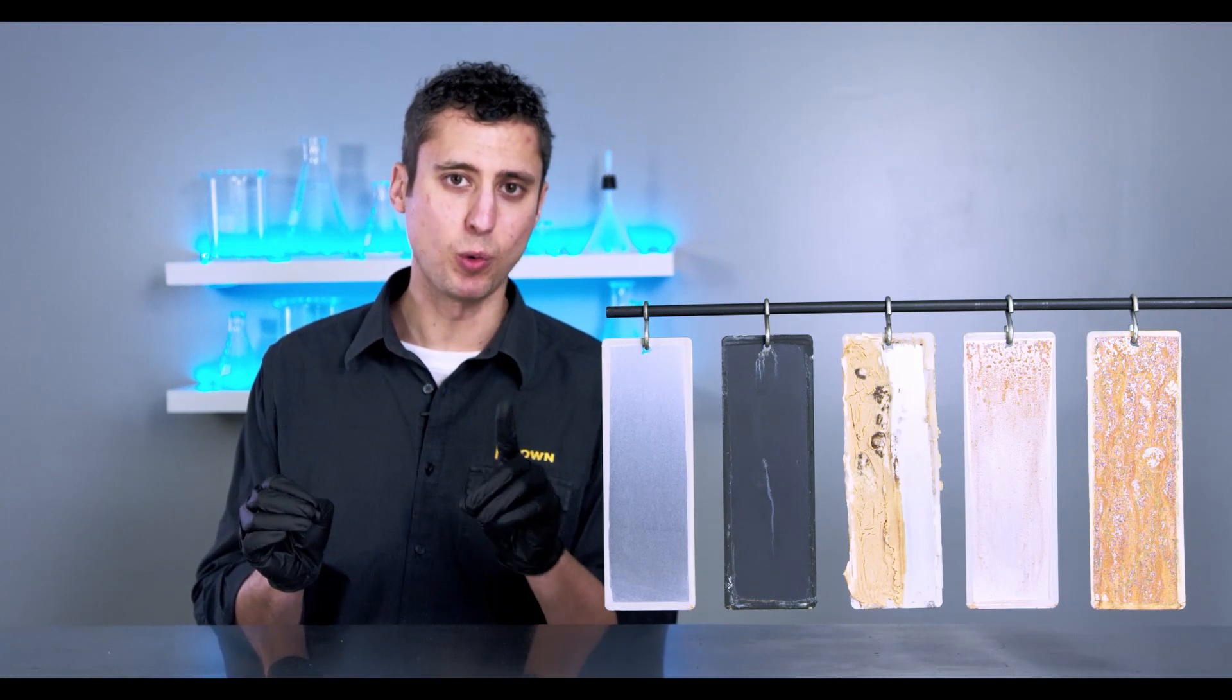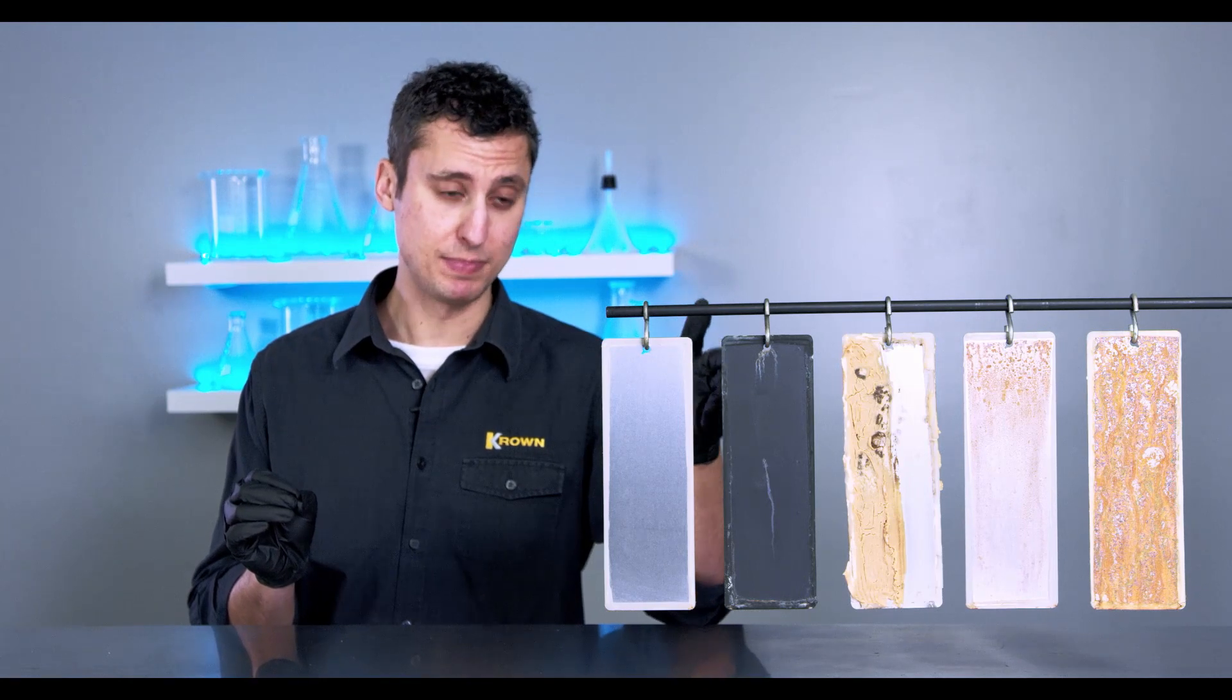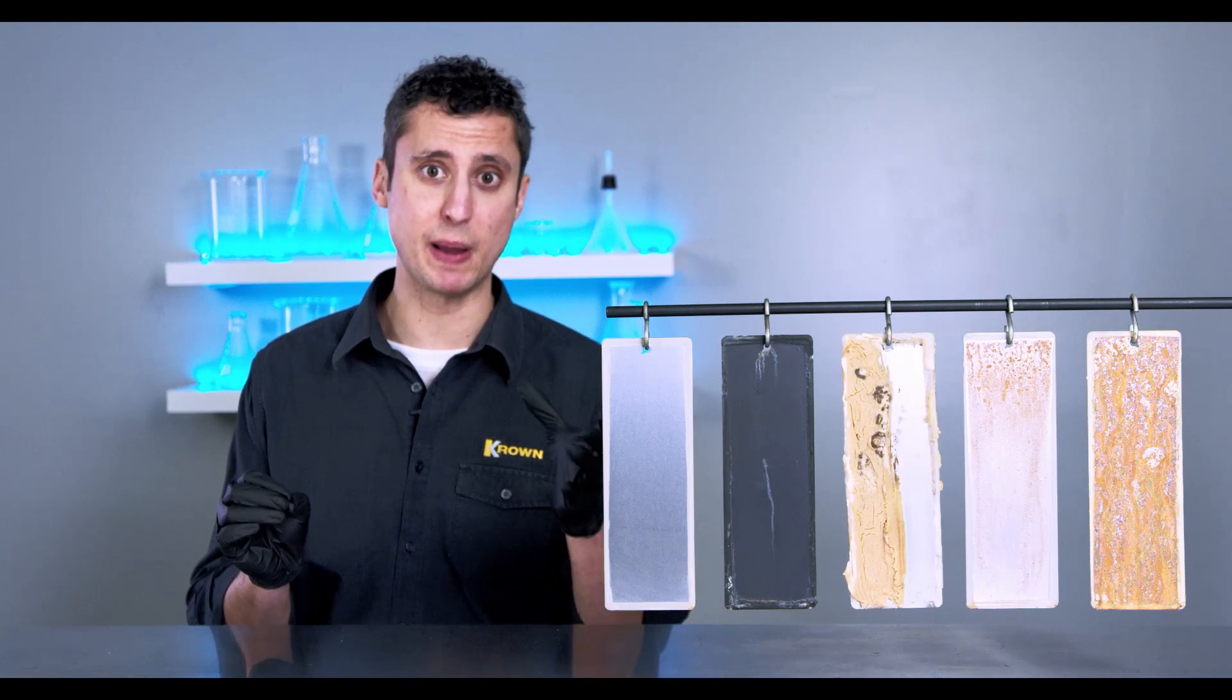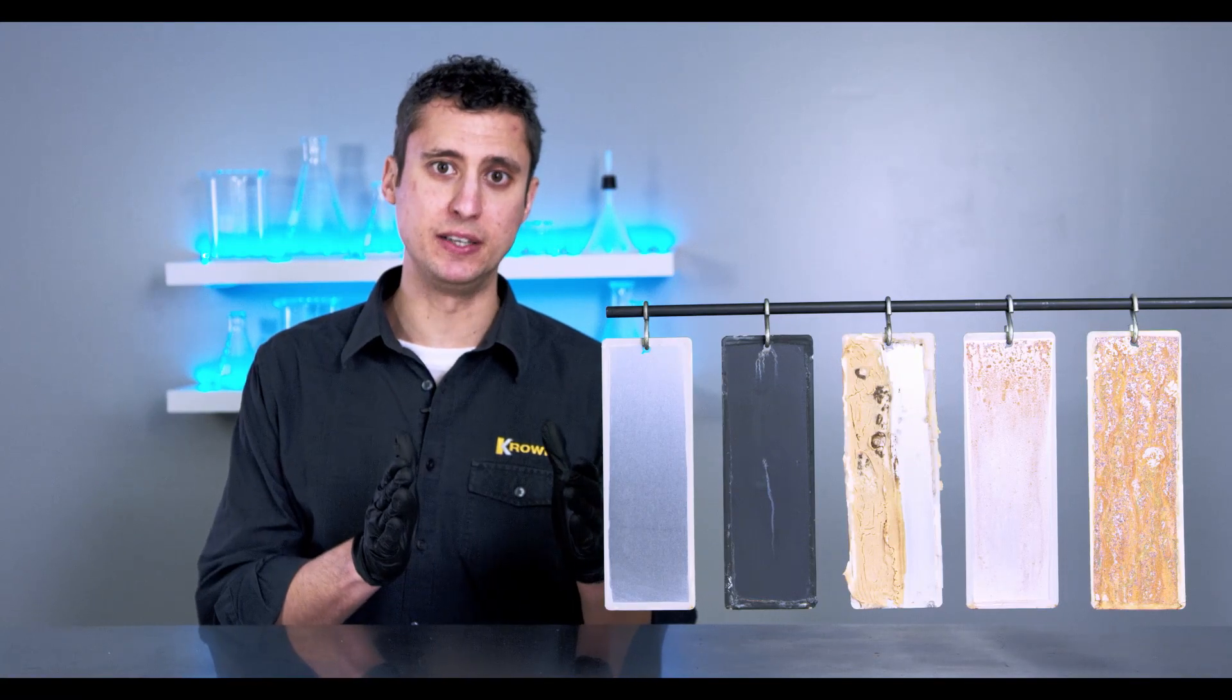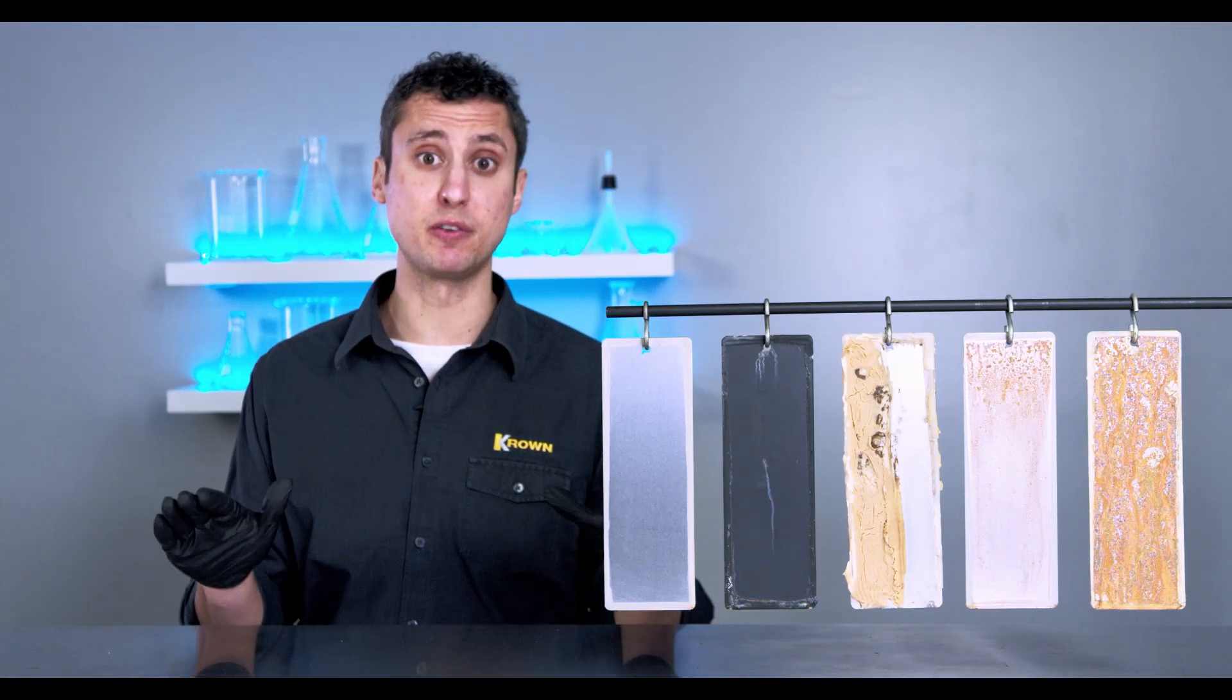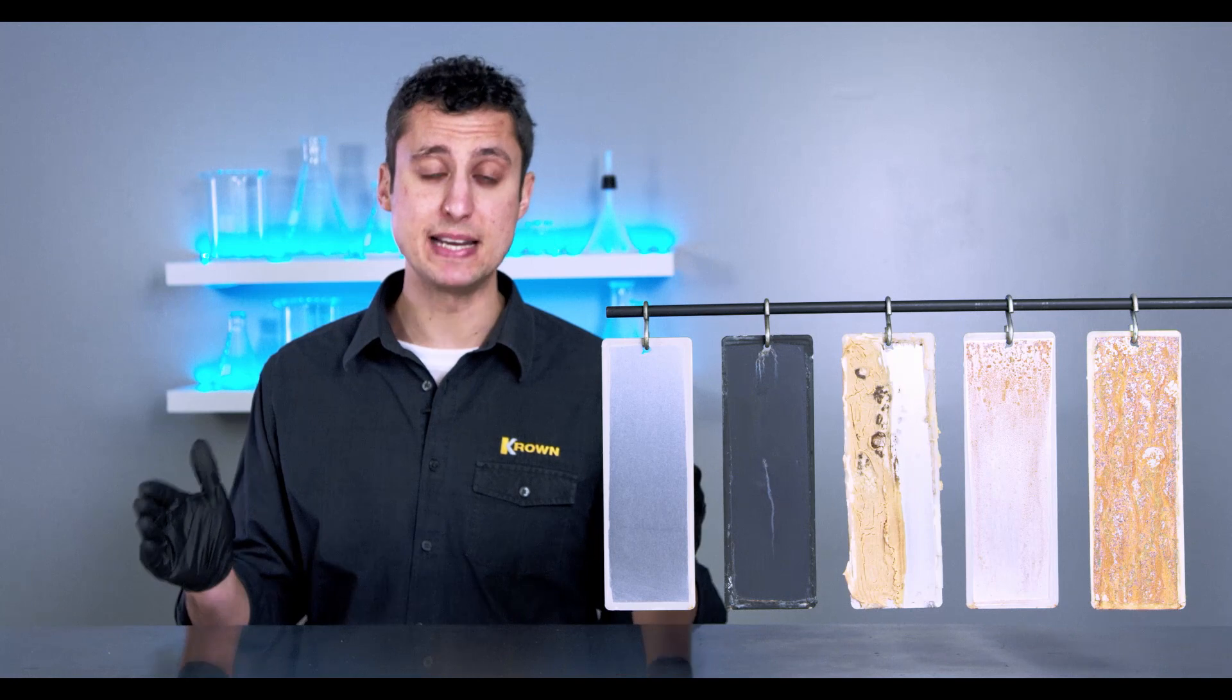Now why is that important to keep in mind? Well, a coating like panel number four, for instance, that rust paint, would be an effective way at preventing corrosion on your vehicle if the entire surface of your vehicle was just one flat piece of metal. But the reality is, how much of your vehicle is actually flat?